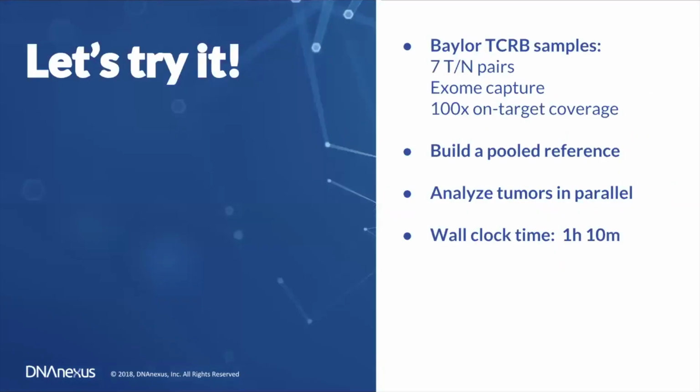So let's try it out. I'll show you a nearly live demo on a set of samples that were provided to the public by Baylor College of Medicine. These are 7 tumor normal pairs that were sequenced and prepared by exome capture to 100-fold on-target coverage. The off-target coverage is about 1-fold, but you don't really need to know that to run this analysis. So we're going to use those 7 normal samples to build a pooled reference. Then we'll analyze each of the 7 tumor samples in parallel.